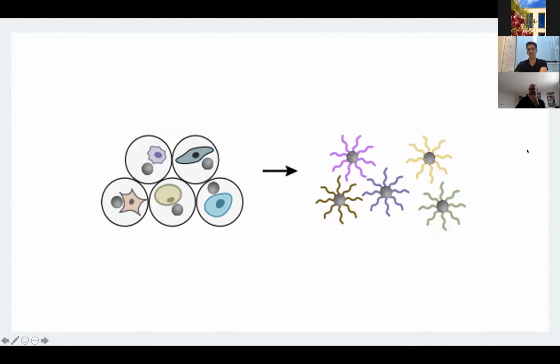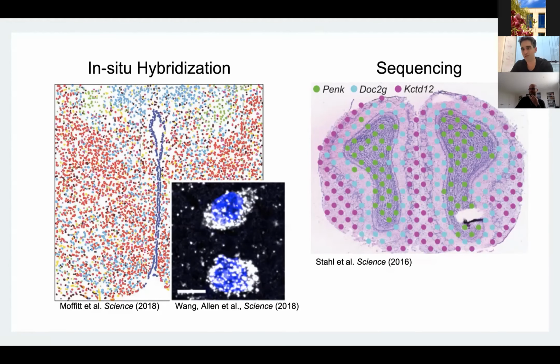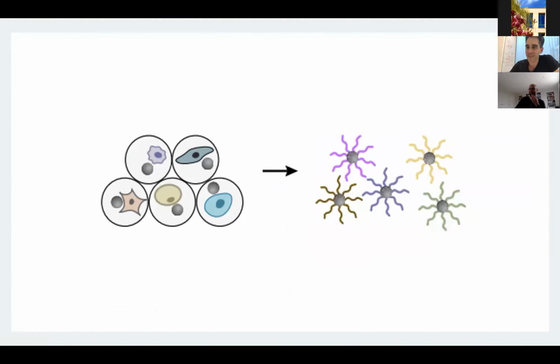So our idea was basically, how do we bridge the gap between these two paradigms and find a way of doing transcriptome-wide gene expression mapping with a single cell spatial resolution. And the idea was just to take inspiration from droplet-based single cell RNA sequencing, where you encapsulate cells in droplets with microfluidic beads and transfer the RNA from the cells onto the beads, and then barcode them that way. And we just said, what if rather than having each bead represent a cell, each bead would represent a location?